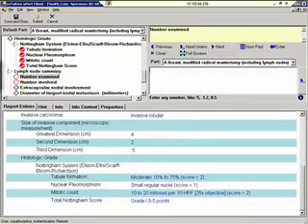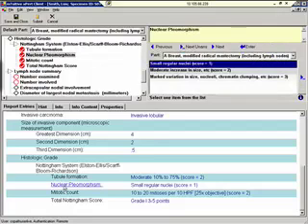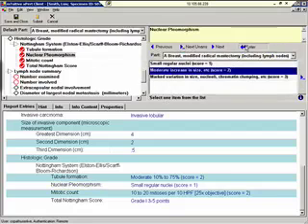for the end user. As you can see, the report includes hypertext fields, in case you need to navigate quickly back to a certain field. Let's click on Nuclear pleomorphism. I'm going to change the value here to moderate. We'll click Enter, and you can see when I did that, the total Nottingham score was recalculated.